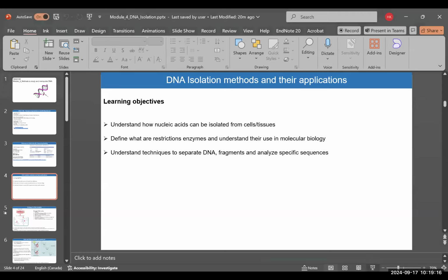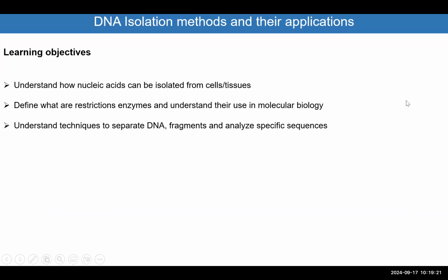So today's lecture is going to focus on how we isolate DNA. But since the process of isolating DNA is quite similar in certain aspects to RNA, I blended them together in this lecture, so that by the end of it you will be able to understand anything related to the protocols used for DNA isolation or RNA isolation.